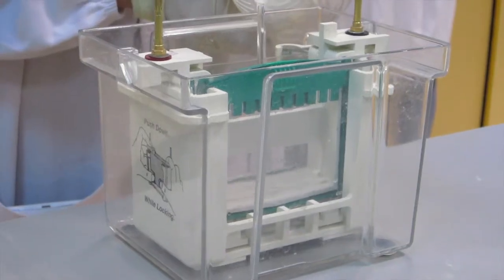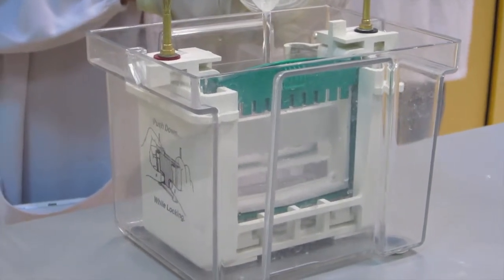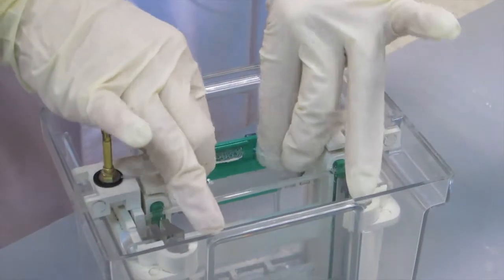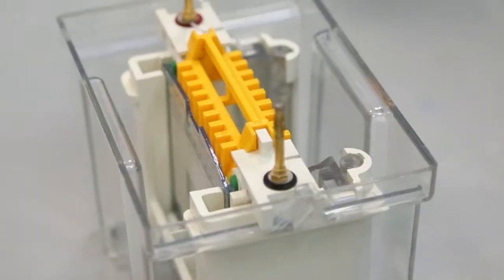Fill the upper buffer chamber of the mini-tank with the electrophoresis buffer prepared earlier till the brim, and then substitute the comb on the ready-gel cassette with a loading guide.